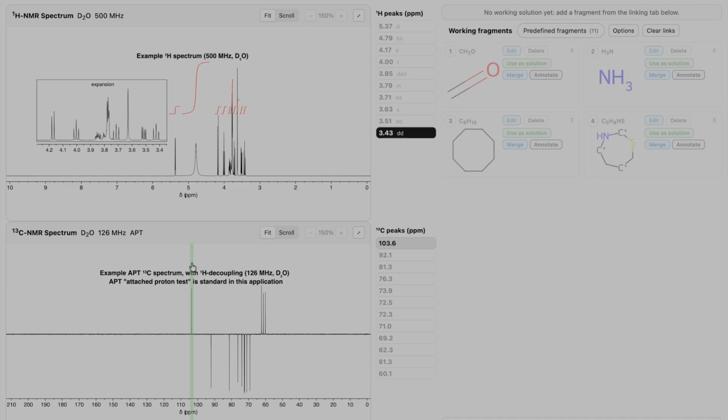This is Molecular Bookkeeping app, a tool made by Team Bullichner to teach organic chemistry students how to elucidate a molecular structure from its NMR spectra. It runs as a standalone desktop app. The chemistry engine, or the kit, and the database all ship inside it, so there is nothing for a student to install or connect to except the app itself.